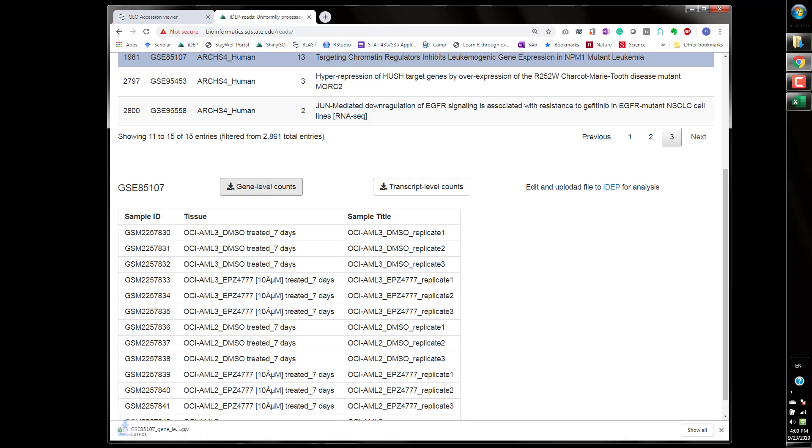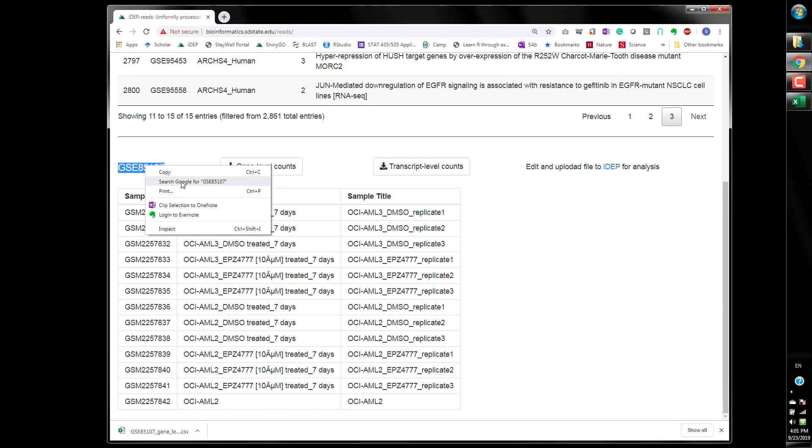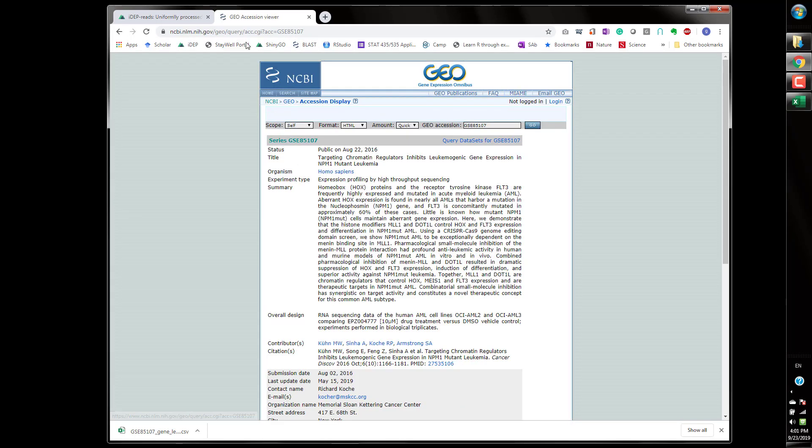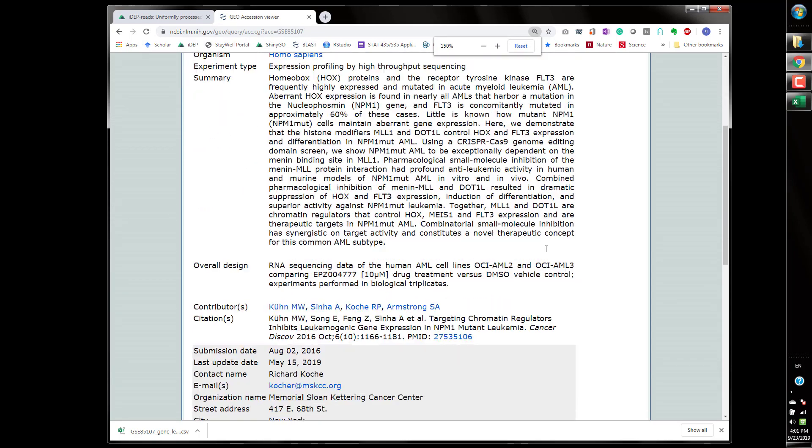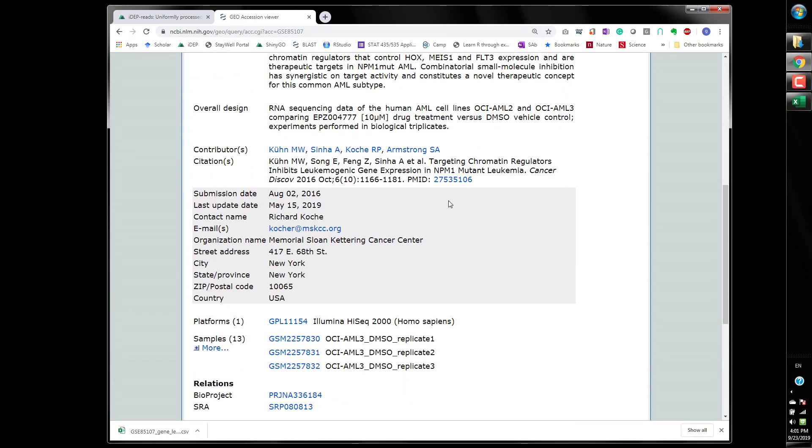So we're going to download the gene expression gene level data and to get more information about the data you can find this information on Google just directly using the GSE number. You can see this is a more detailed explanation of this data.